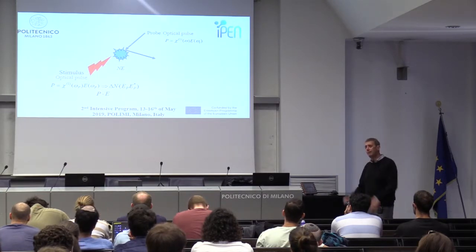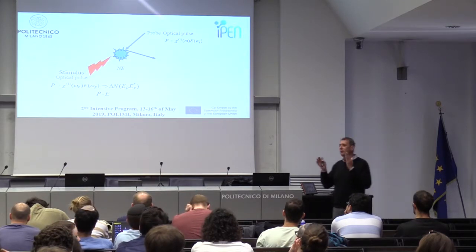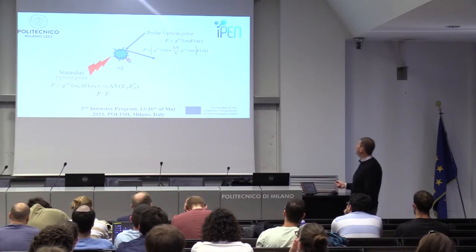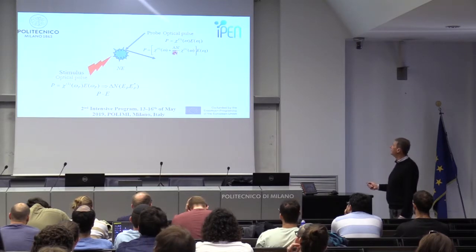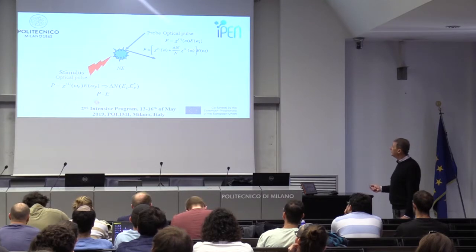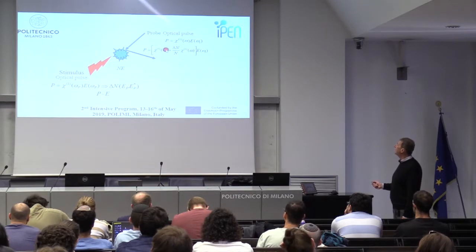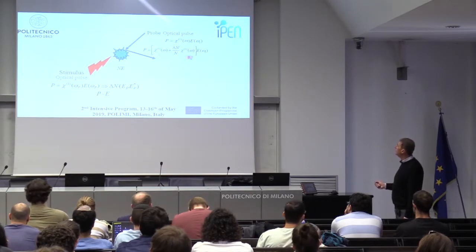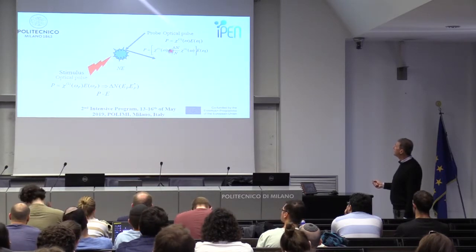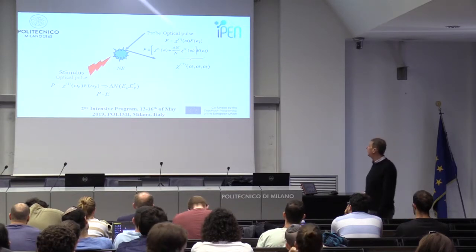So that's the pump. Now, if you can separate well in time the pump and the probe, then the nonlinear formalism becomes much simpler. Let's see why. Now the probe is coming. The probe is also interacting with the sample through a linear process. But now, when you modulate and change the population, you add the delta n, a change in the ground state population. Also, the linear response is changing. And you see that you can write this as the original linear response plus a modification, a change in the linearity. And this is a sort of effective linear approach.